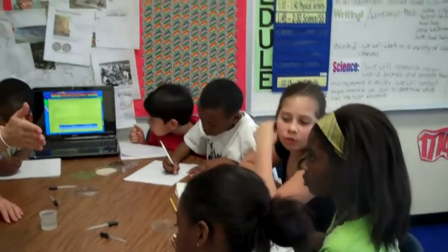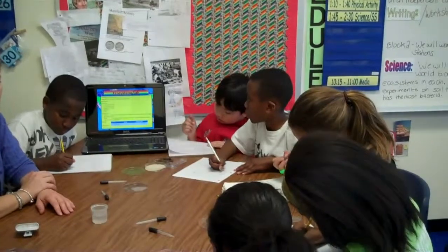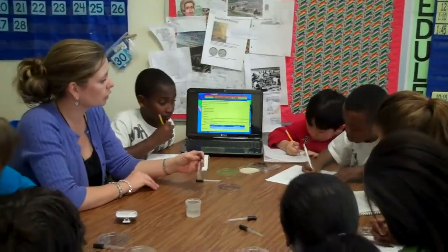It's these two, so go ahead and do 12 drops, because that means you can put 4, you can put 4, and you can put 4. Yep. How many drops? For 12. You put 12 in each one.